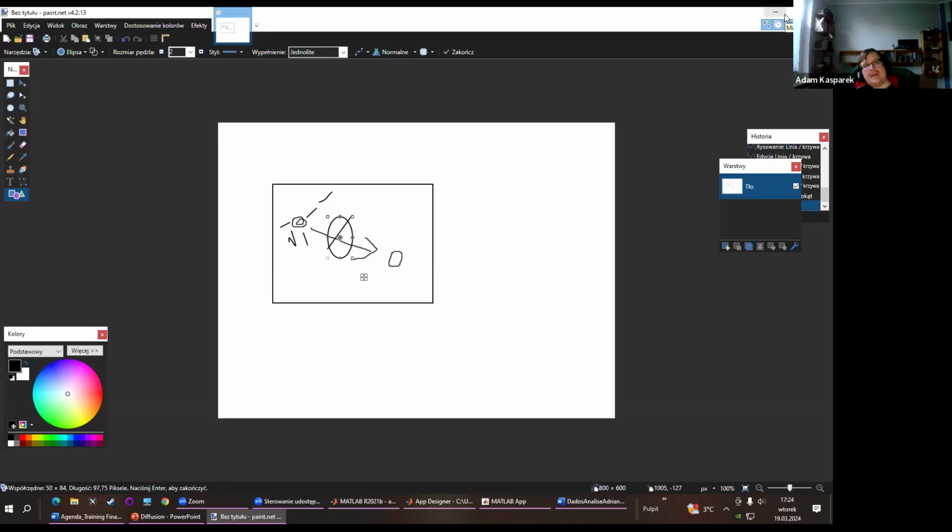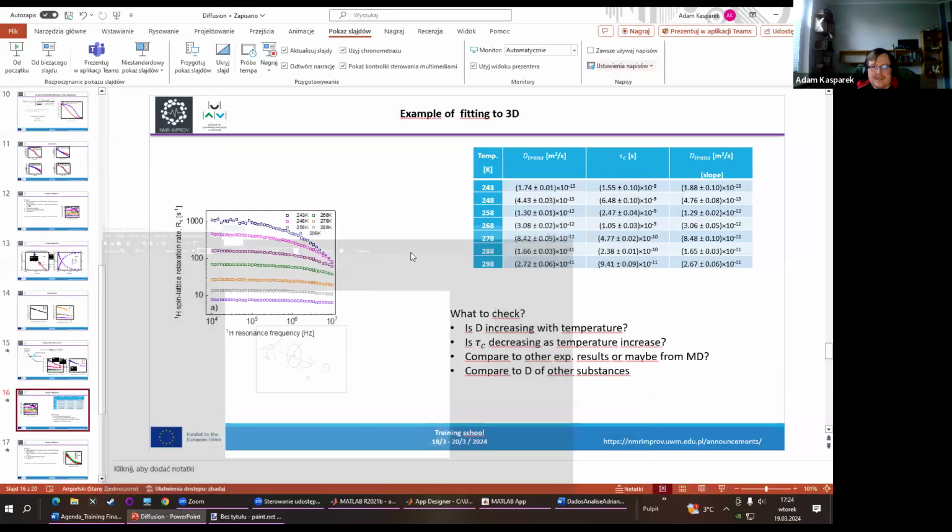Sometimes there is a combination of values which doesn't make physical sense, but makes sense from a mathematical point of view. Our programs don't think. They are not intelligent, and they are just checking this one parameter which they got. In the case of better programs, a few parameters, but that's beyond the point.